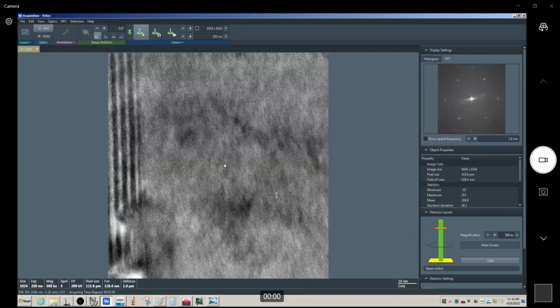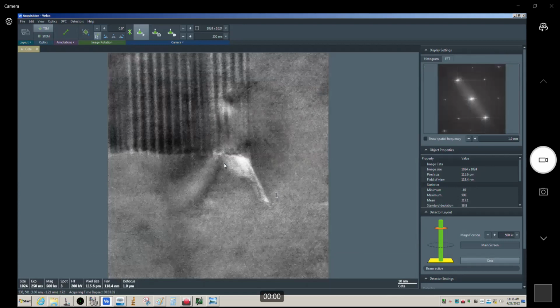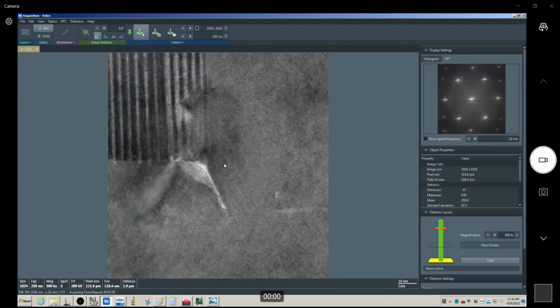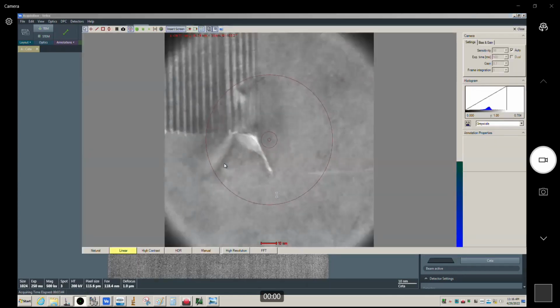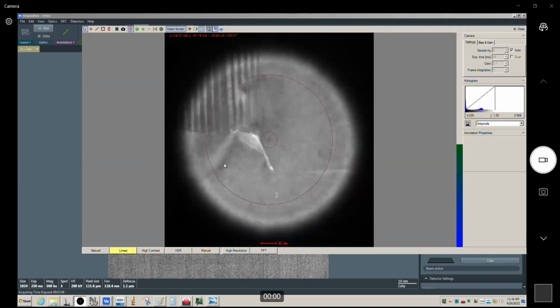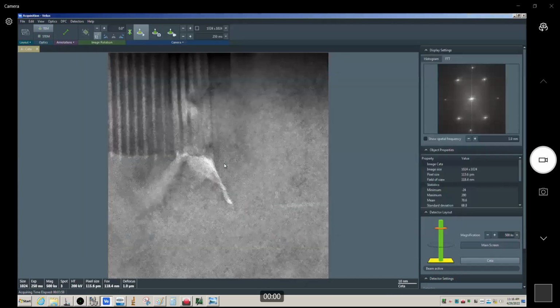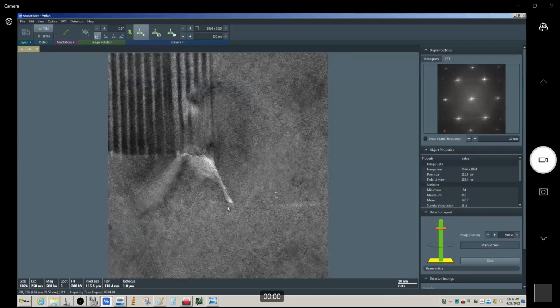Oh, it actually went pretty close, strangely enough. Look at that. Now there may be a difference in the focal conditions between the two points, because there might be a little bit of a height difference. So it's probably a good idea to check, and yeah, there was. Right, so it's actually not too bad. Yep, so it looks good right there. And I already knew my astigmatism was good.